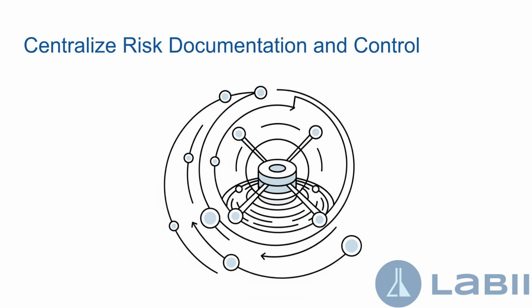Labii provides a unified workspace to manage risk registers, hazard analyses, and mitigation strategies. Whether you're implementing ISO 14971, HACCP, or ICH-Q9, Labii adapts to your regulatory needs while maintaining full traceability.